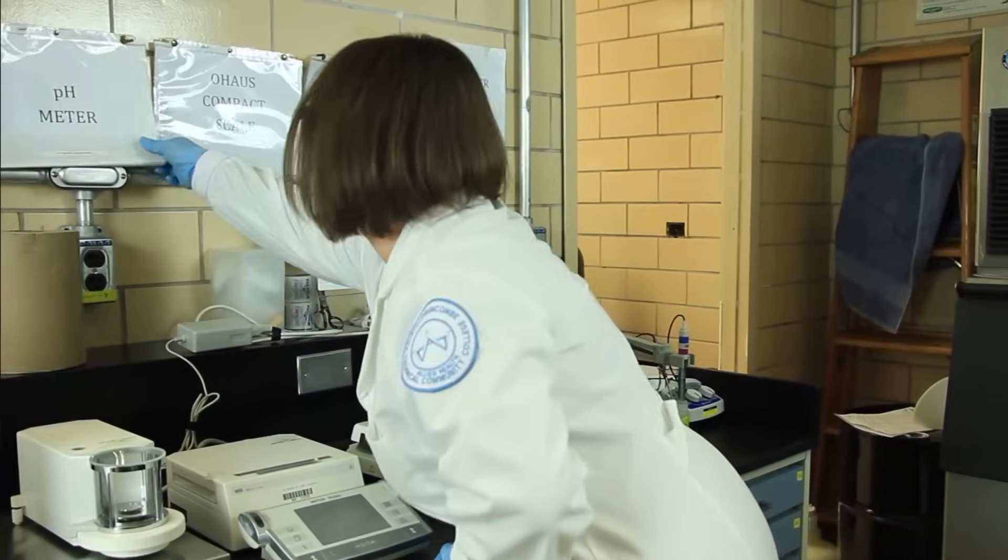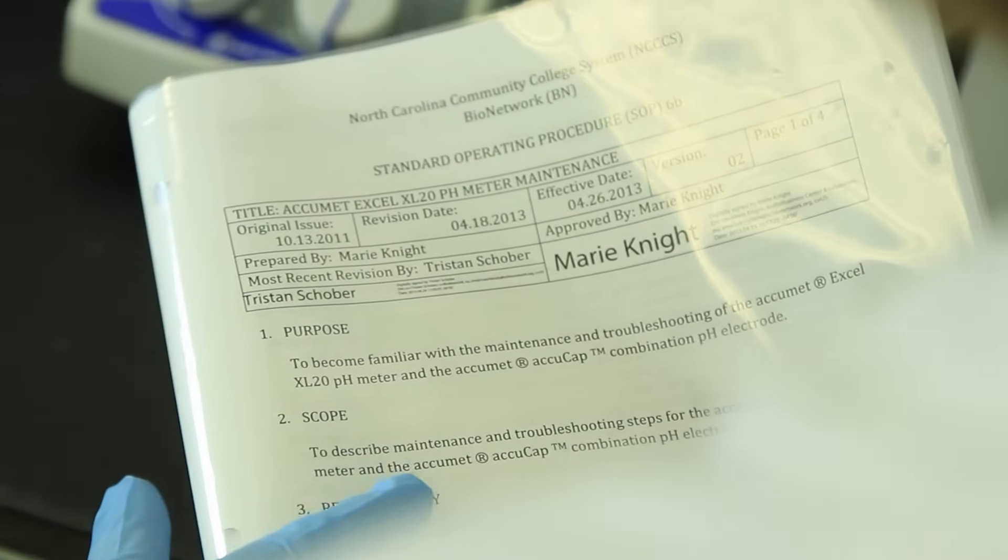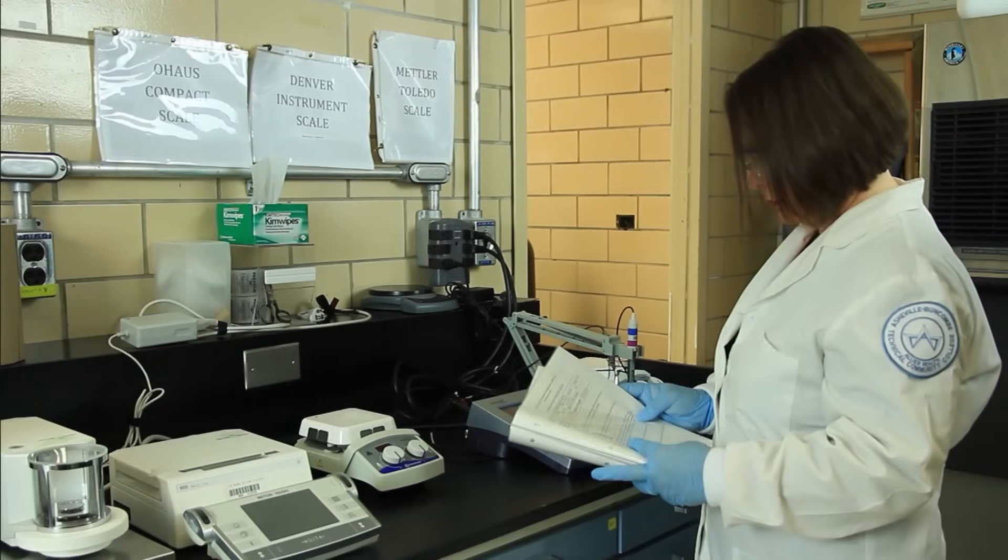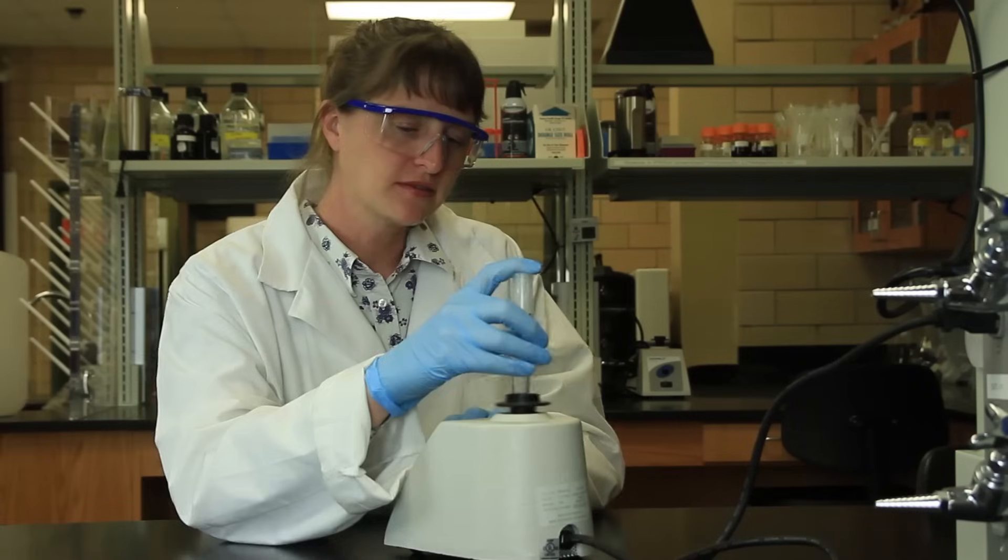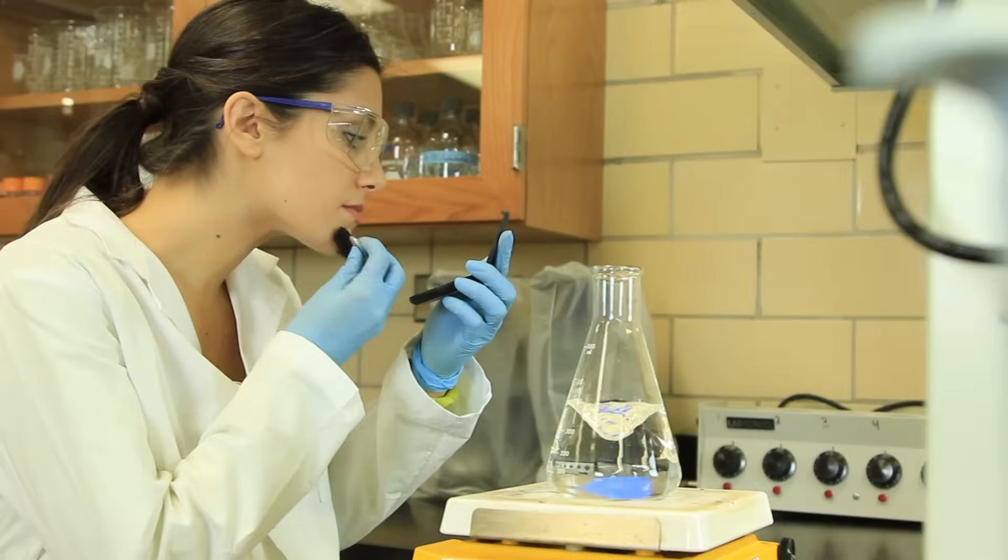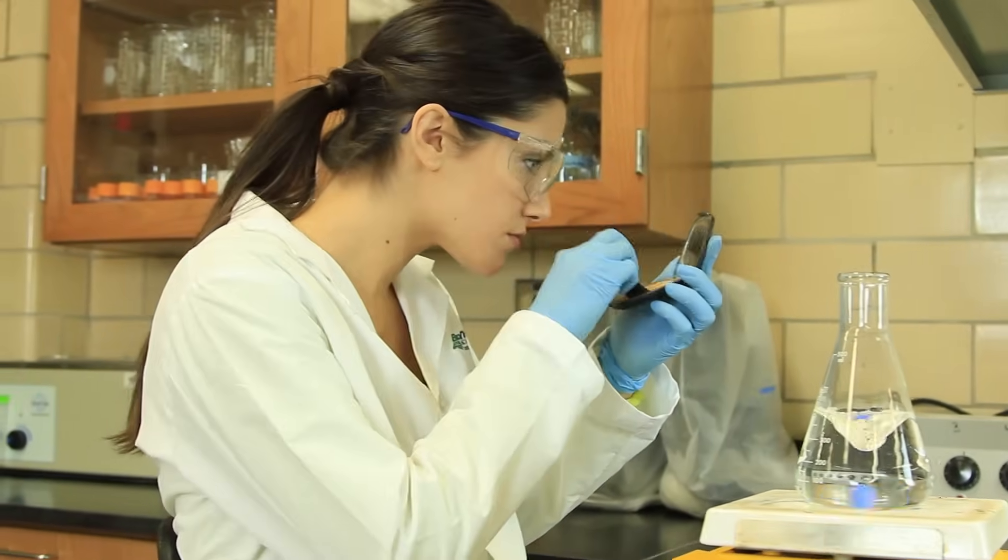The first consideration is to follow the written standard operating procedures step by step. Never eat, drink, chew gum, or apply makeup while in the lab. You don't want to contaminate your skin or risk ingesting poisonous chemicals. You could also contaminate your experiment and ruin the results.